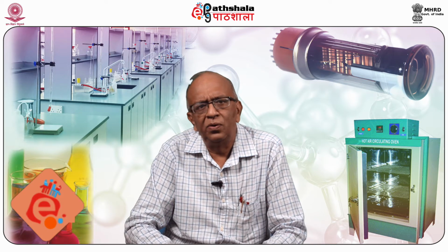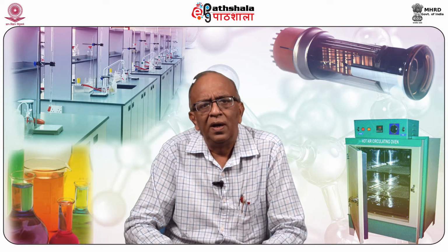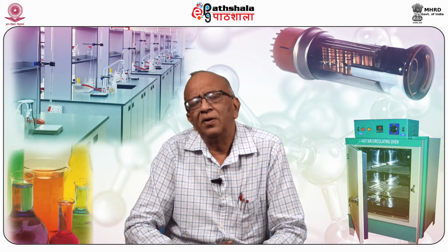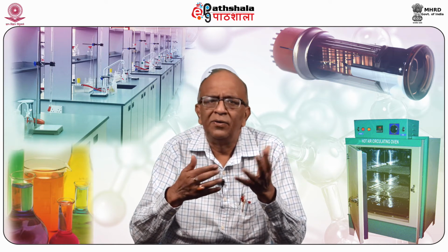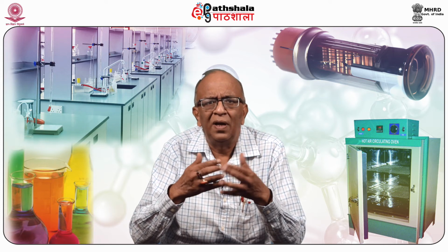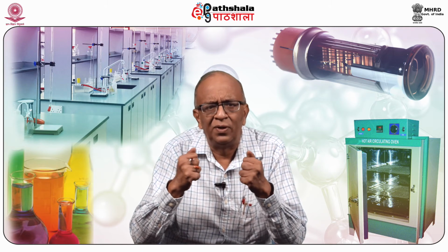Today we are going to discuss the module Automatic Analyzers and Process Control under the paper Fundamentals of Analytical Chemistry. Here we shall discuss different types of automatic analyzers, how to interface them with different types of laboratory instruments, and also instruments present in different types of industries.